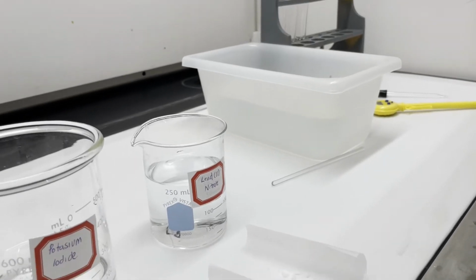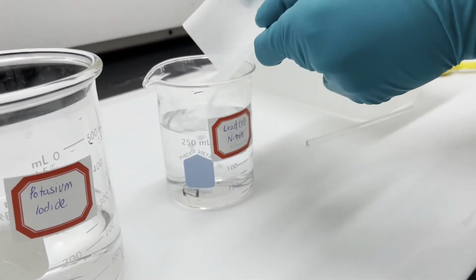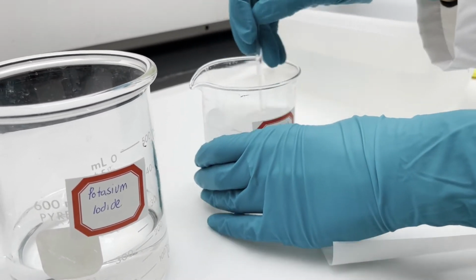For this demonstration, you will need lead nitrate, potassium iodide, an Erlenmeyer flask, a hot plate, some test tubes, and a small pipette. I'm going to start by pouring the lead nitrate and dissolving it into some water. And then I'm going to stir it with a stir rod to just make sure it's evenly mixed.